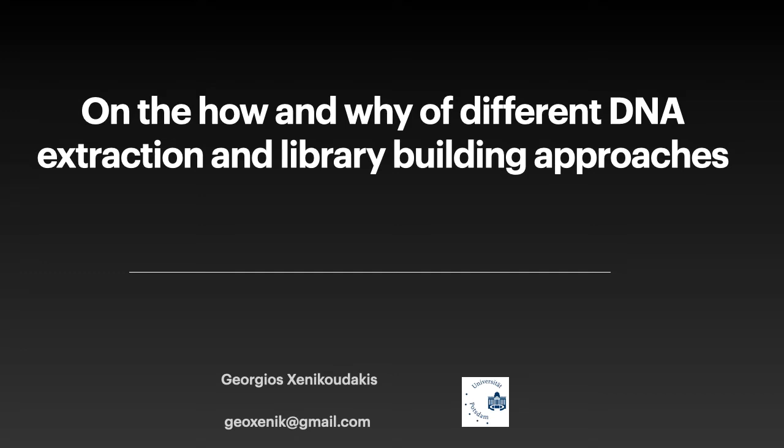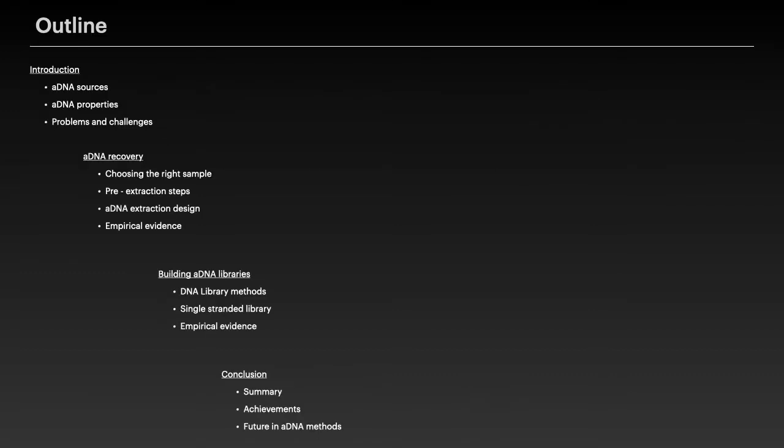Today I would like to give you a presentation which has a long title on the how and why of different DNA extractions and library building approaches. This is about extraction and library protocols we often use in ancient DNA research, the reasons why scientists had to develop new methods, and how these methods are implemented in the lab.